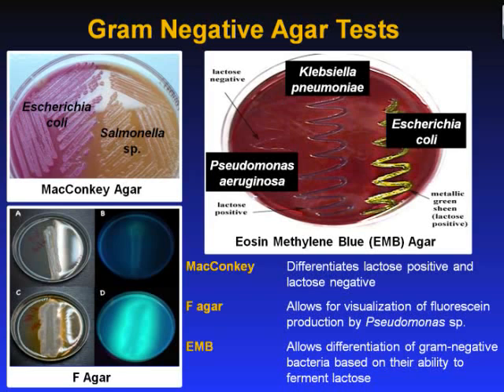The bottom left photo shows F-agar, sometimes called flo agar. It is used to stimulate production of the pigment fluorescein. This allows for specific detection of Pseudomonas species. Note the intense fluorescence of the pigment fluorescein under UV light. A shows Pseudomonas fluorescens growing on nutrient agar in ambient light. B shows Pseudomonas fluorescens growing on nutrient agar in ultraviolet light. C shows Pseudomonas fluorescens growing on F-agar in ambient light, while D shows Pseudomonas fluorescens growing on F-agar in ultraviolet light.